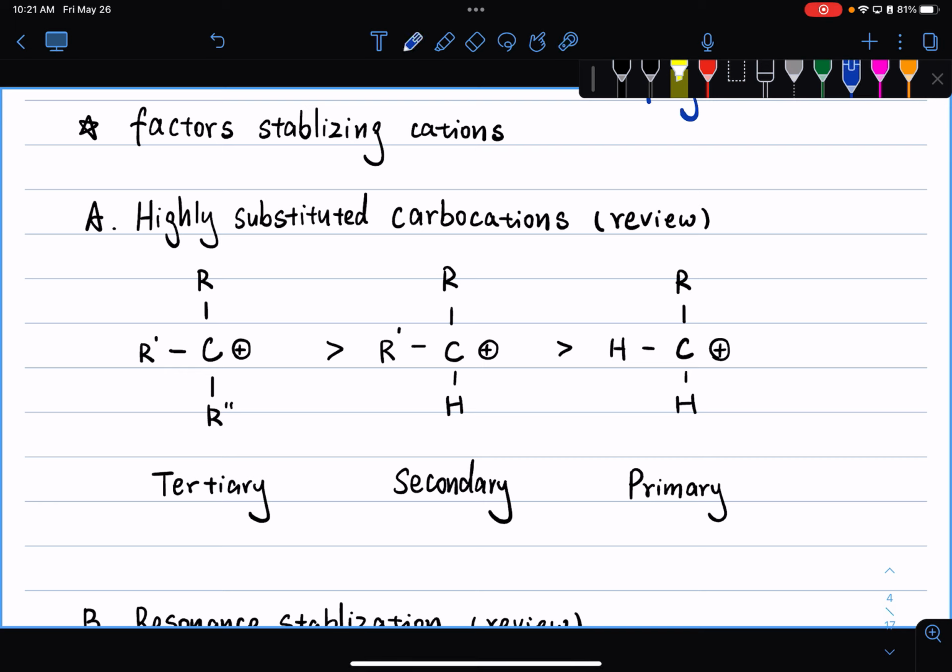So one of the kinds of questions you could expect is, let's imagine we have a molecule like this. Let me make it more extraordinary. We have a tert-butyl group. Here we have an isopropyl group. You can have a tert-butyl group. So which chemical bond is more likely to break, and which fragment is likely to be your base peak?